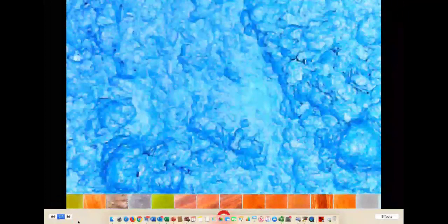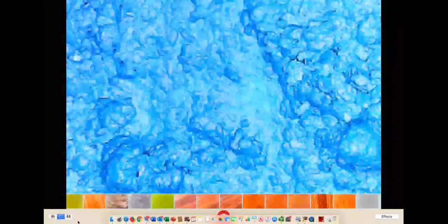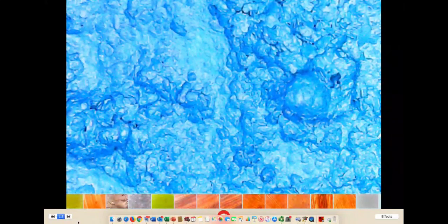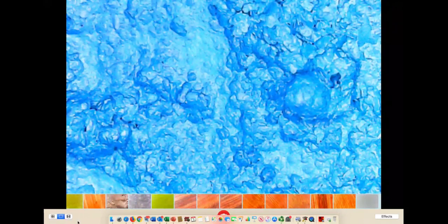I'm able to capture footage, JPEG or video, and can come back in a day, a week, or a month after subjecting the surface to variables like ultraviolet light. I can inspect and see; at the same time I can turn this around and look at the back of the feedstock.